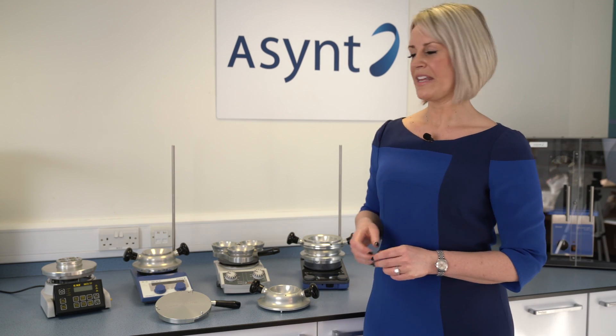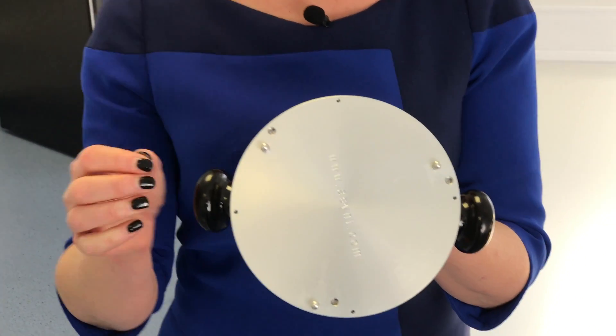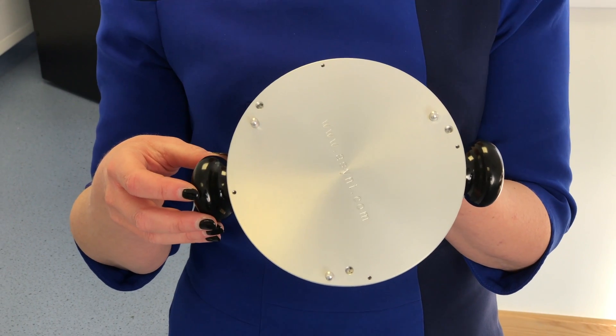The Asynt Drysyn units have a unique feature whereby you can change the pins on the base of the unit to fit any stirrer hotplate. This includes Cat, Bibi, Asynt, Heidolf, Aika, and Stuart.